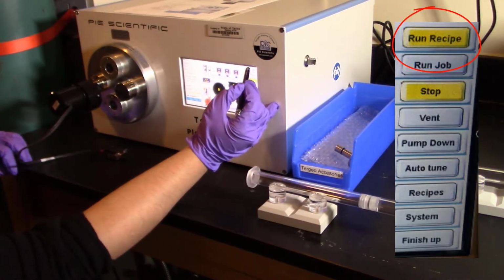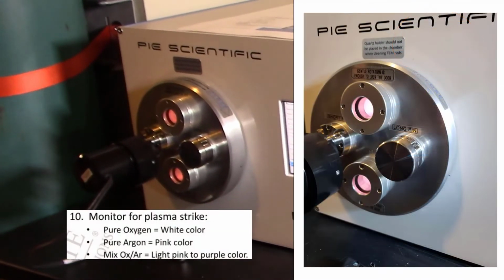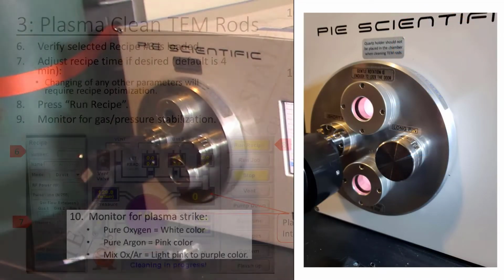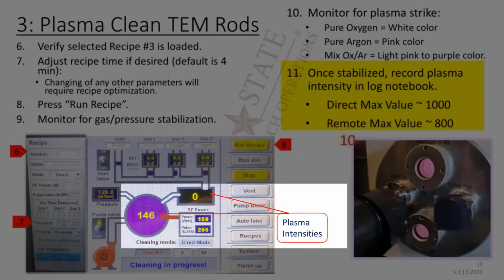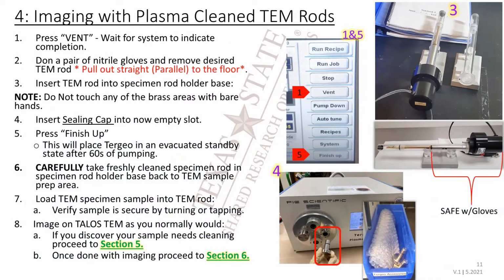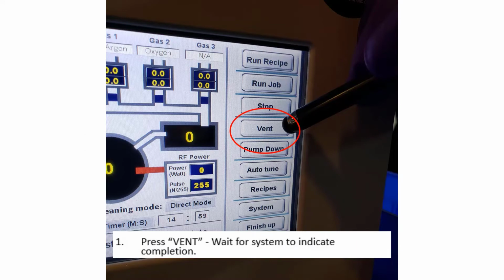Press Run Recipe and monitor for gas pressure stabilization. Monitor for the plasma strike. Once stabilized, record the plasma intensity number into the log notebook. After the cleaning sequence has been completed, press Vent and wait for the Tergeo system to indicate completion.